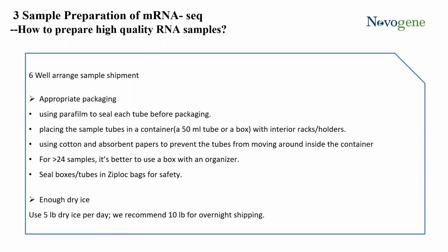And we always recommend shipping samples on dry ice. We recommend using 5 lb of dry ice per day and at least 10 lb of dry ice for overnight shipping.